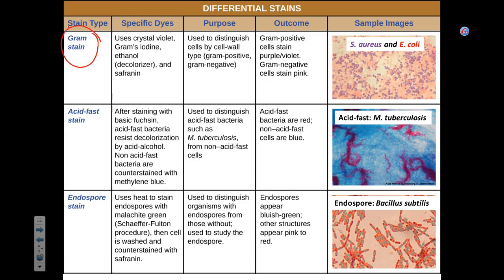We will talk about procedure in 3 minutes, but remember when we talked about cell wall in bacteria, Gram stain allows you to distinguish these two big groups of microorganisms. Gram positives with a membrane and thick peptidoglycan cell wall, and Gram negatives, the membrane, thin cell wall, and the outer membrane.